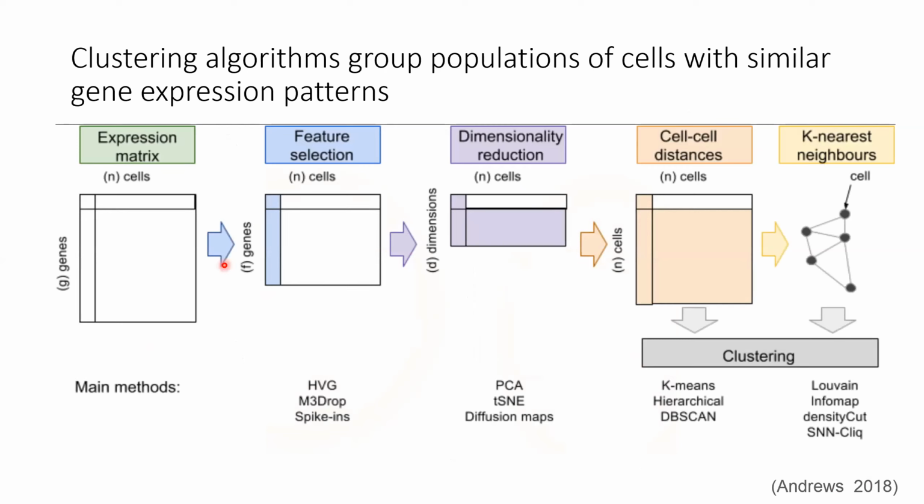So in addition to the curse of dimensionality, people are often concerned about clustering on the original data because highly expressed genes can dominate the distance calculations, just because bigger UMI counts lead to bigger distances in the distance matrix. So often clustering on feature selected data or PCA reduced data can be more robust and give clusters that align more with existing biological knowledge.